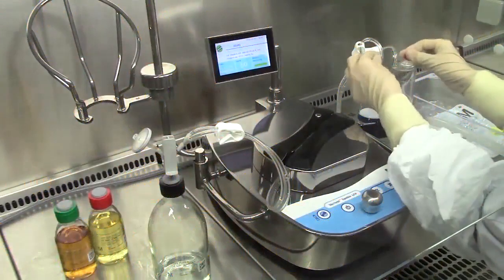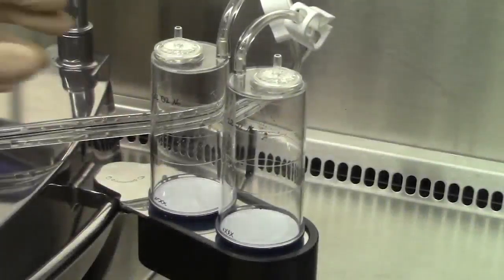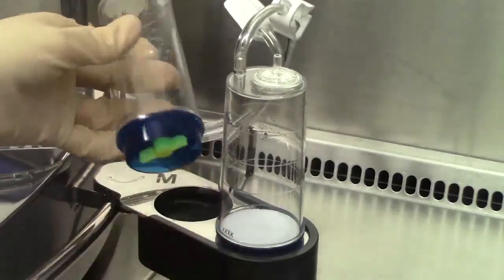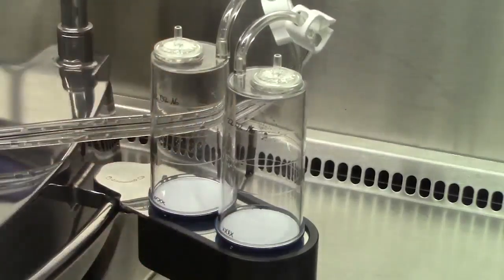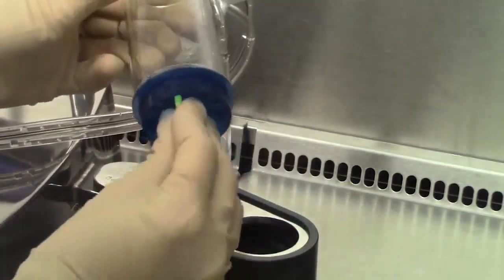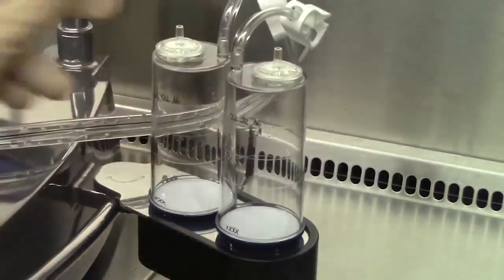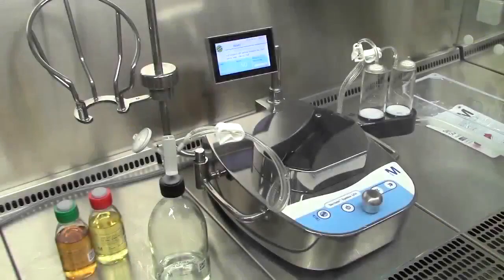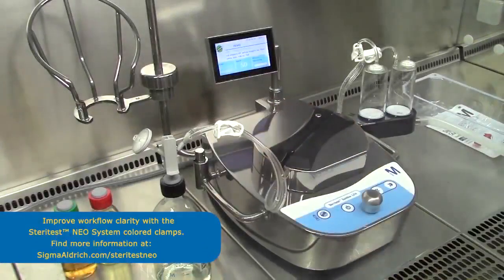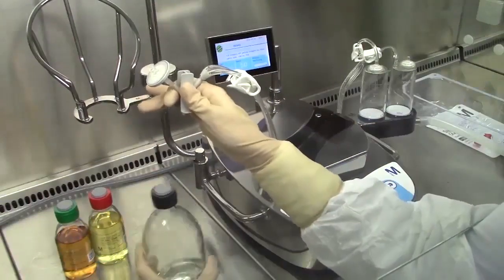Remove the red plugs from each of the canister's vents. Aseptically insert a yellow plug onto each canister outlet port and turn it a quarter turn. Take care not to touch the outlet ports or the inside of the yellow plugs. Put the canisters back onto the drain tray. Clamp off one tubing using one of the clamps on the sampling needle side. Note that one tubing has a black line and the other does not.